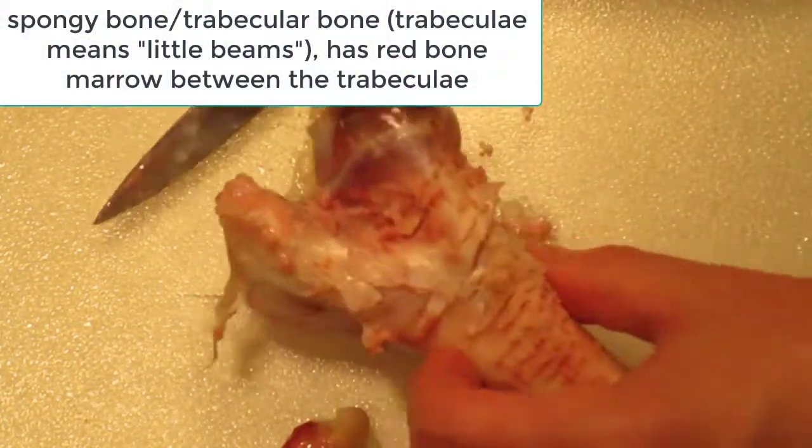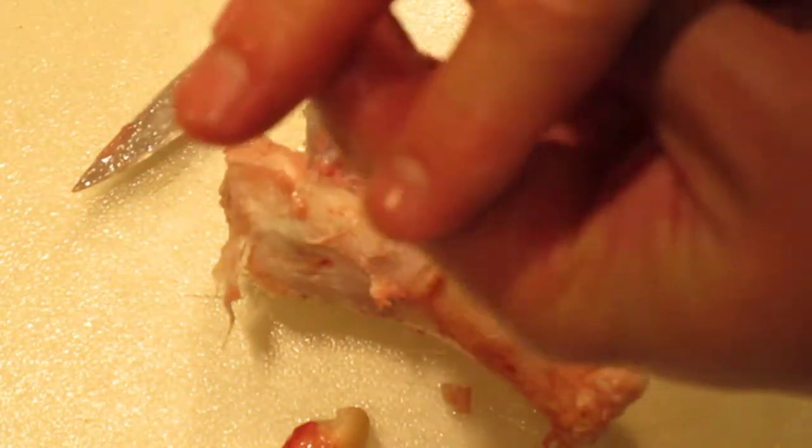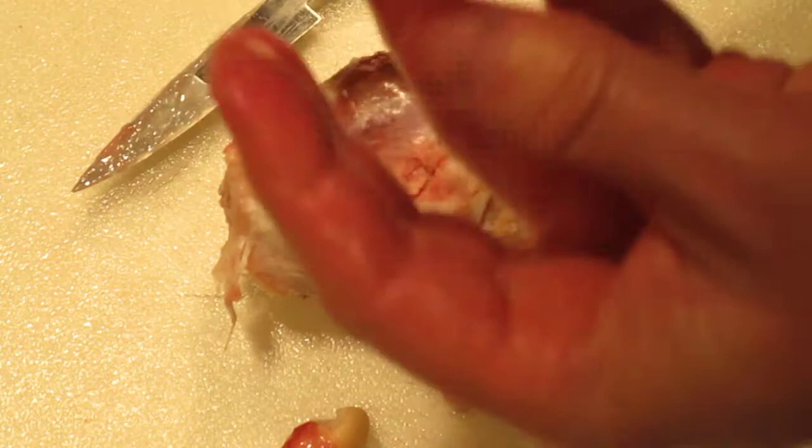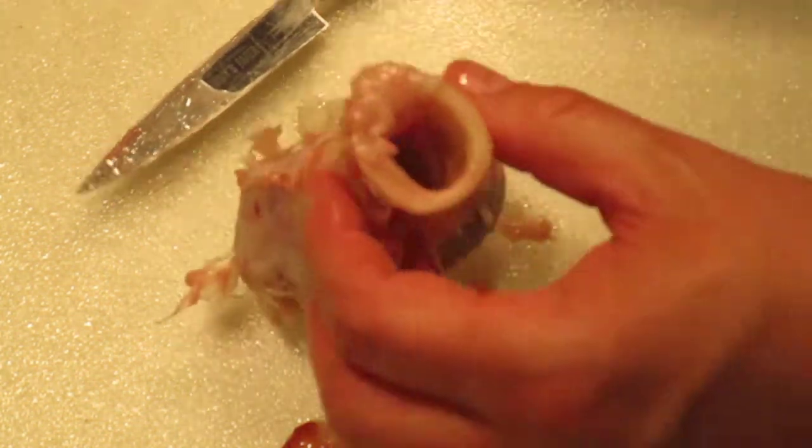That's the spongy bone, or trabecular bone. Remember, it's all crisscrossed like that and has red marrow between those trabeculae — the little beams. When you crunch into it, it's not as hard as the cortical bone.